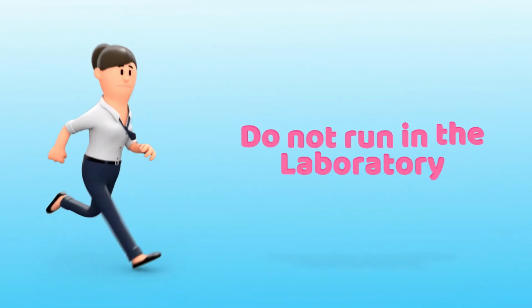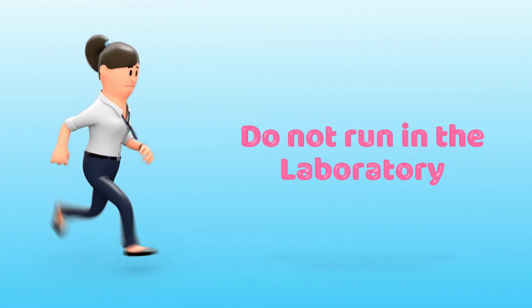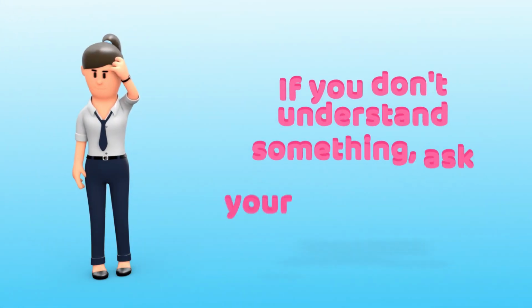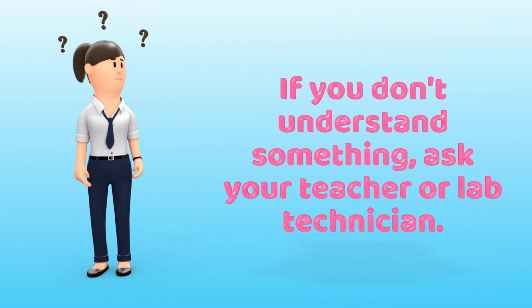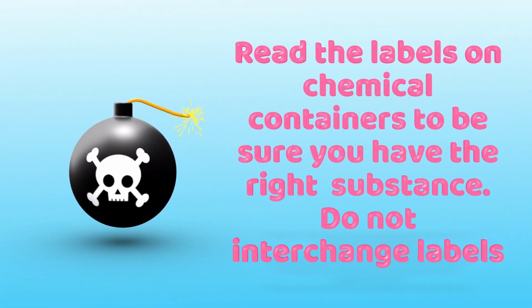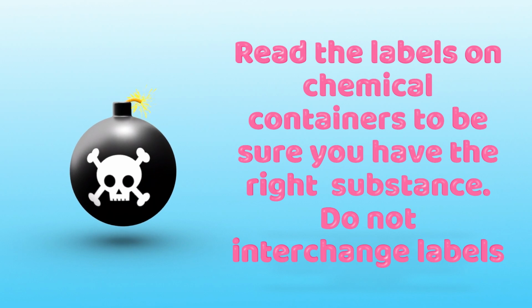In addition, when you are in the laboratory, you are not supposed to run. When you are in the laboratory, you are not supposed to play. And if you don't understand something, you may ask your laboratory teacher or laboratory technician. Also, another thing which you must understand is that you make sure you read the labels on the chemical containers to be sure you have the right substance and do not interchange the labels.